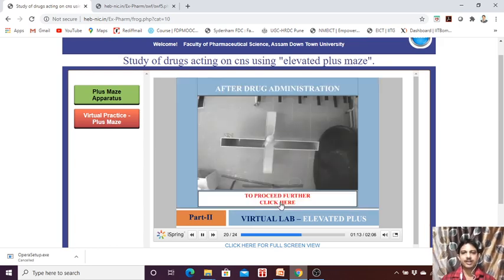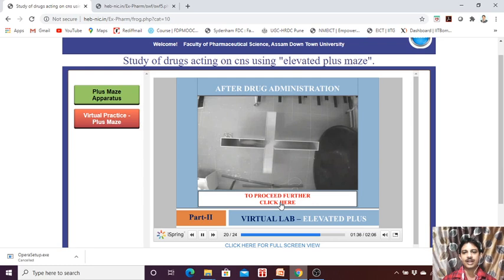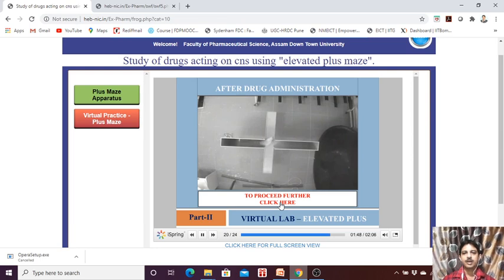After drug administration, we record how many times the animal enters each arm. It depends on the drug: if you give a CNS stimulant drug you will find one type of effect; if you give a CNS depressant drug you may find a different type of effect. In all cases, we need to record the number of entries and total time spent by the animal, and observe the animal behavior.